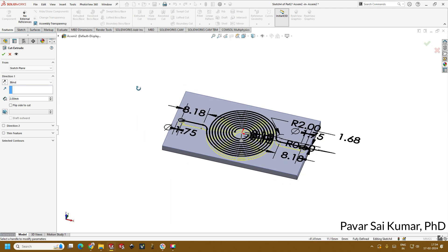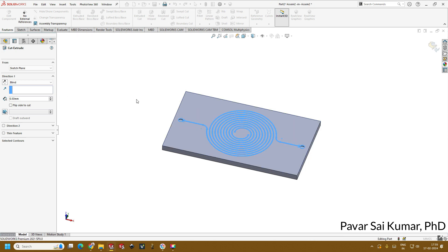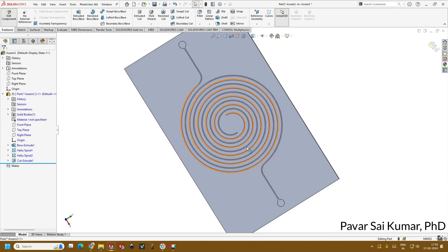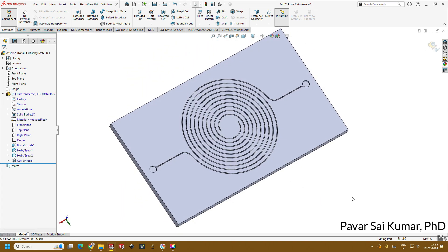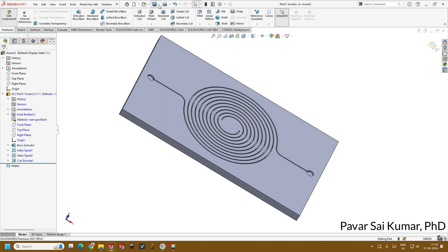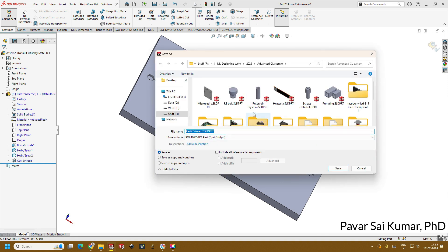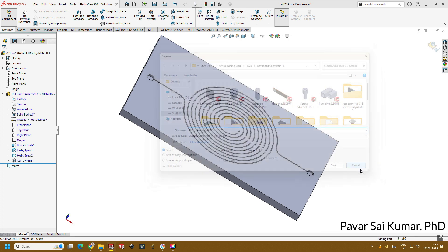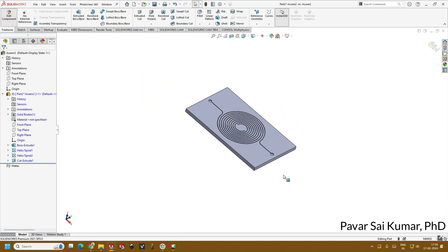Go to Features, Extrude Cut. Create the extrude cut to a depth representing the microfluidic channel depth in finite microns and press OK. You can see the nice channel pattern formed on the chip. Now save this file — save as — in your designated folder.